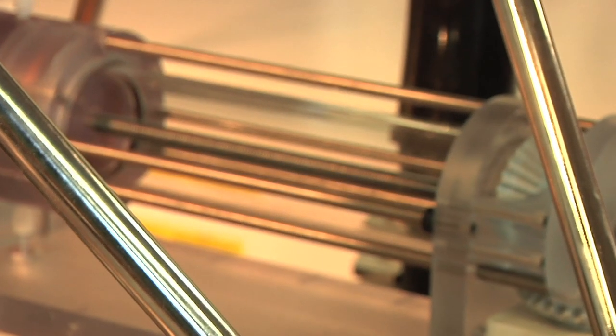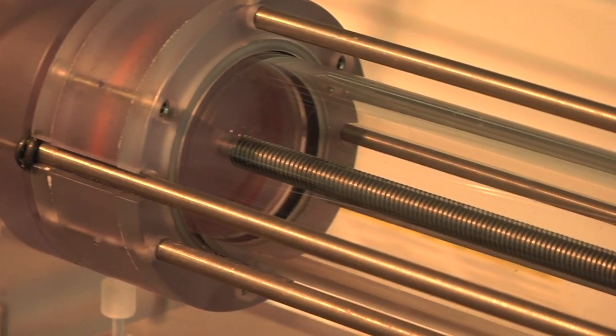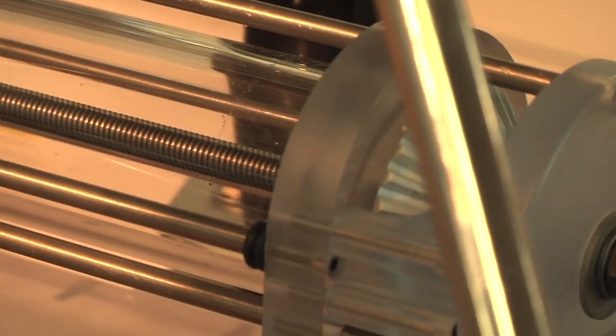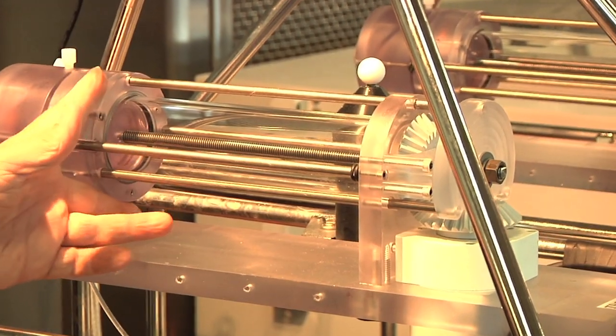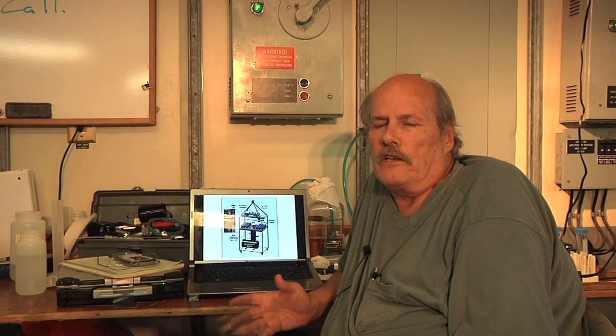The way it's done is that the sample is drawn into an incubation chamber that acts very much like a syringe. So this syringe pulls the sample in from the environment and at the same time introduces our C13 bicarbonate tracer, and it automatically mixes with the sample and it incubates in that chamber for a specified period of time.